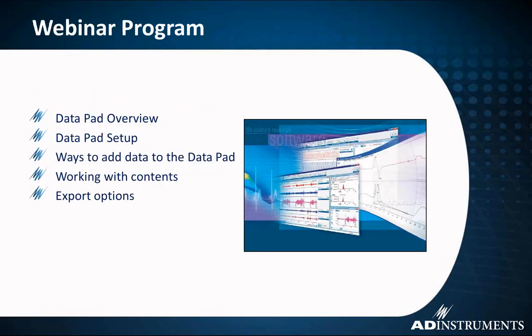Okay, so getting into the webinar for today, we're going to be looking at the DataPad, which you'll see is a very useful and powerful tool within LabChart. So we'll be starting with an overview of the DataPad. I'll be showing you how to set up the DataPad to extract the information from your data in ChartView.